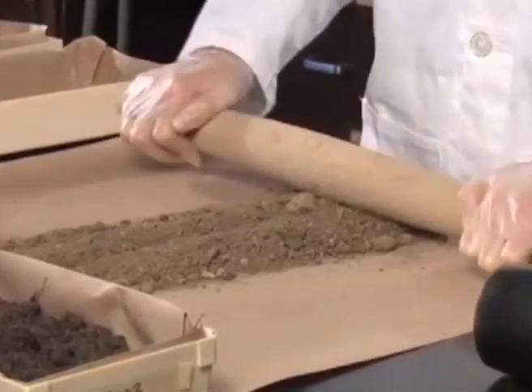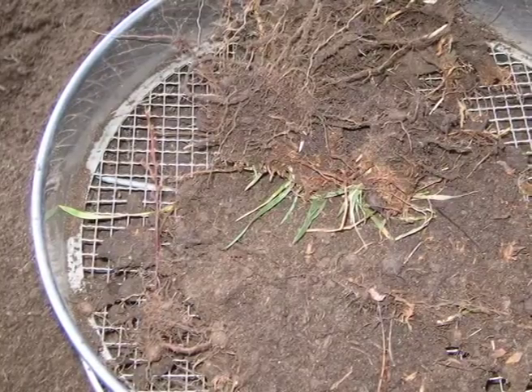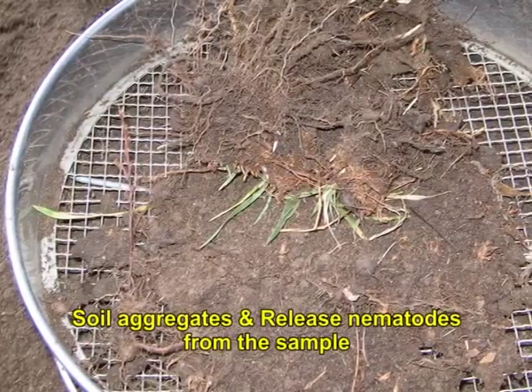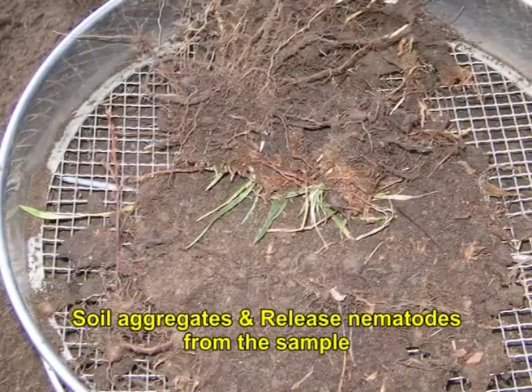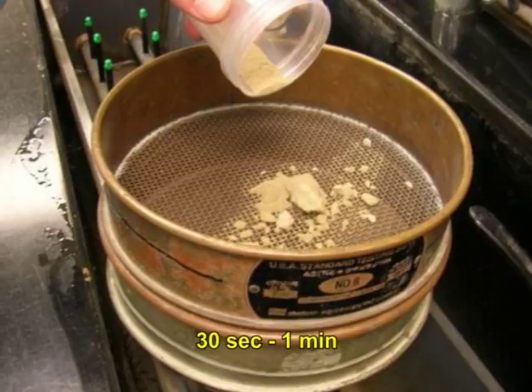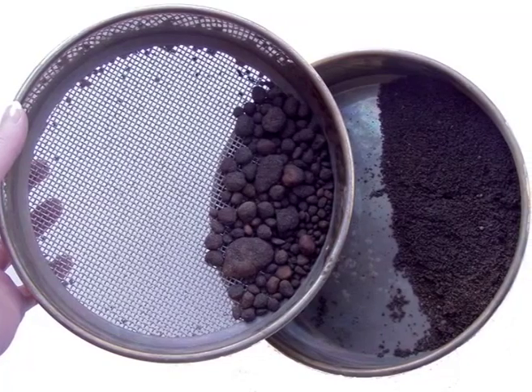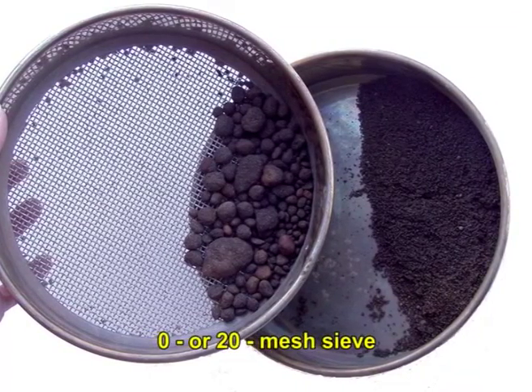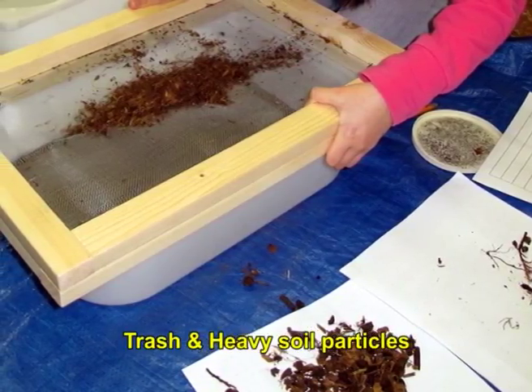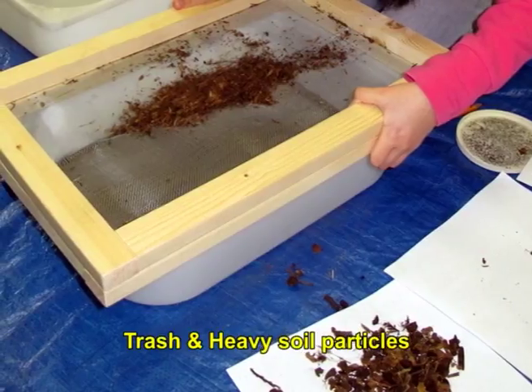Now, most of the nematodes are found suspended in water. Some workers make use of a flocculating agent like Separon NP10 in order to break up soil aggregates and release nematodes from the sample. Now, let this muddy mixture settle for 30 seconds to 1 minute. This is followed by decanting the muddy water through a 20 mesh sieve into a second bucket. This step removes trash and heavy soil particles. Care should be taken not to pour the sediment, which is disposed of later.